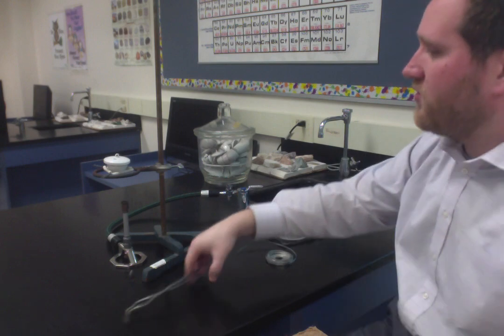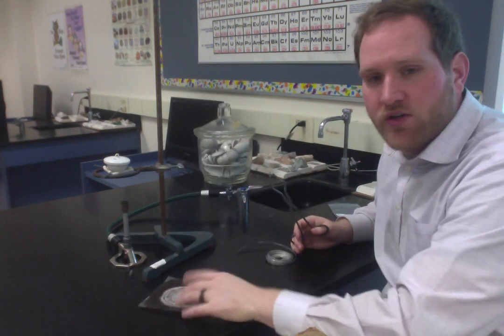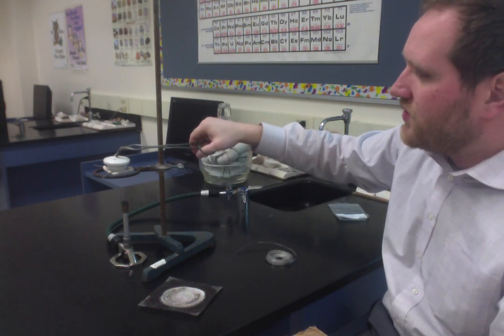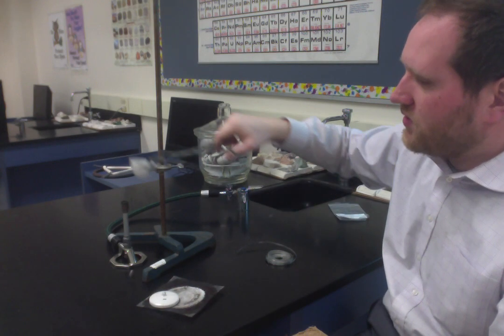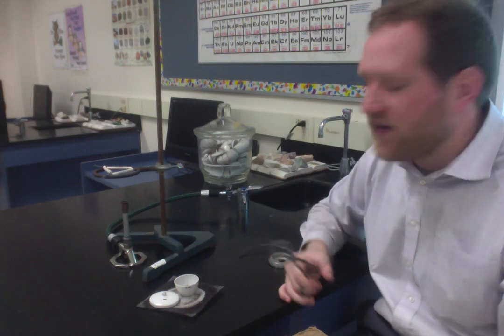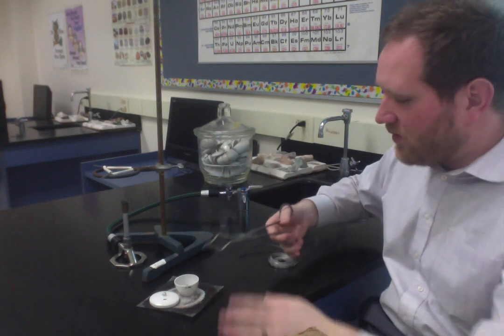And you're going to take the crucible and transfer it to this ceramic mesh. You're never going to put this directly on the lab tables because it'll burn them. So this carefully goes onto the ceramic mesh. The crucible goes onto the ceramic mesh, and now you're just going to allow it to cool down. You don't want to put it directly on the balance when it's super hot because it'll break the balance. So you want to give it time to cool down. What we're going to do is allow some time to pass.